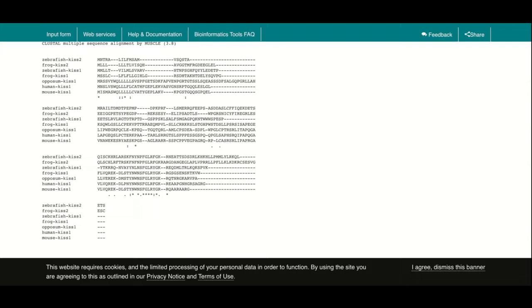Generally speaking, whichever produced more stars is a better alignment, because it found where the amino acids agree, and it had to introduce this indel, this gap here, so that this arginine would shift up. It could have kept it there and shifted these ones down. Sometimes it doesn't really make a difference.